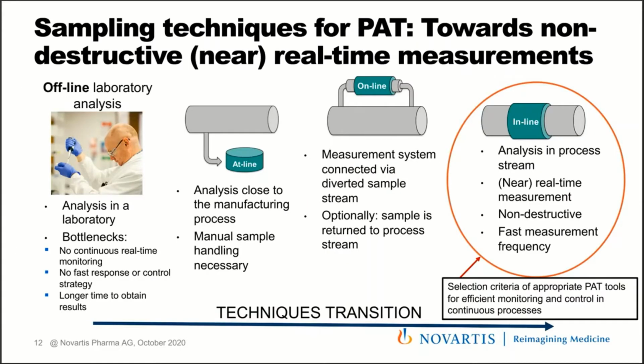So I already mentioned what we're looking at. We are basically looking at the inline techniques. If we go through the different approaches for sampling, so how PAT tools can be incorporated in your process stream, we have different terminology.